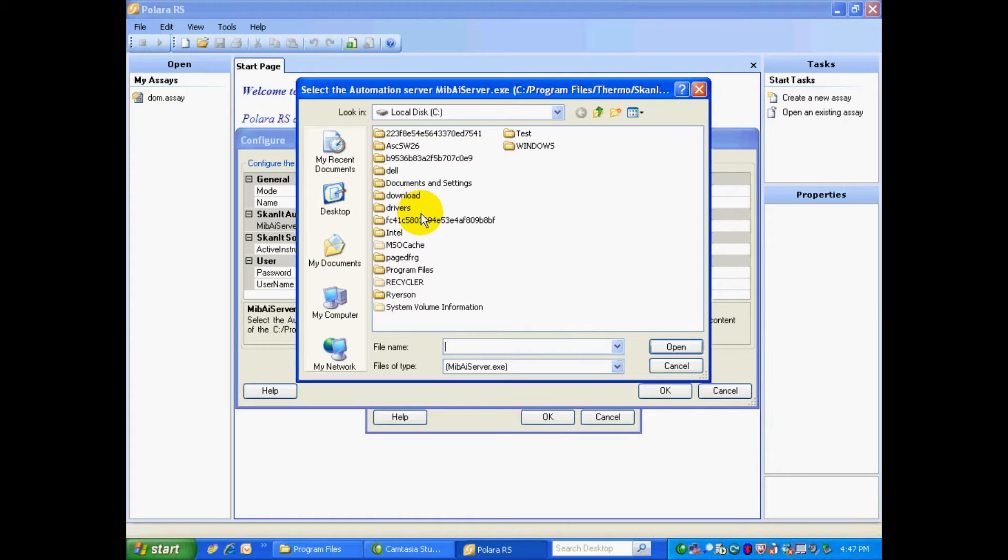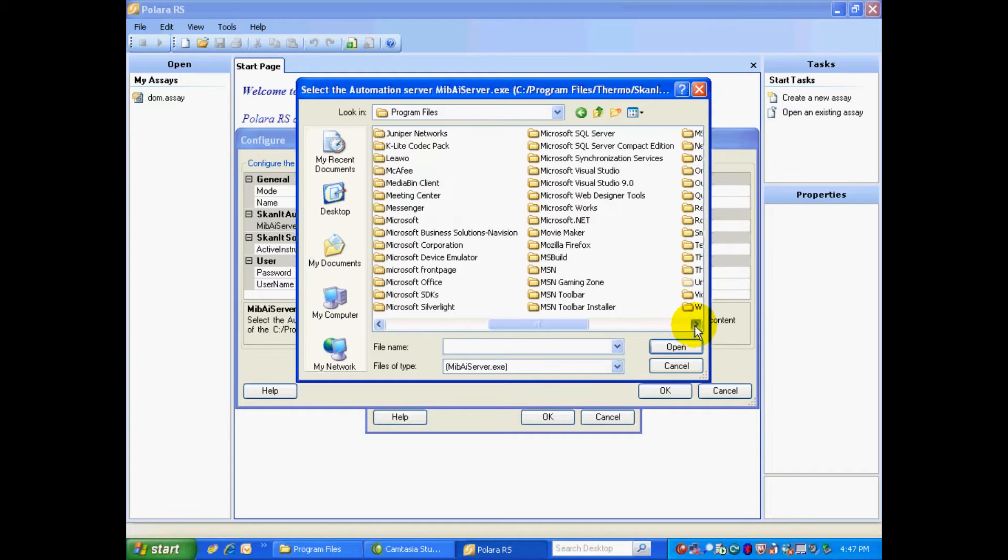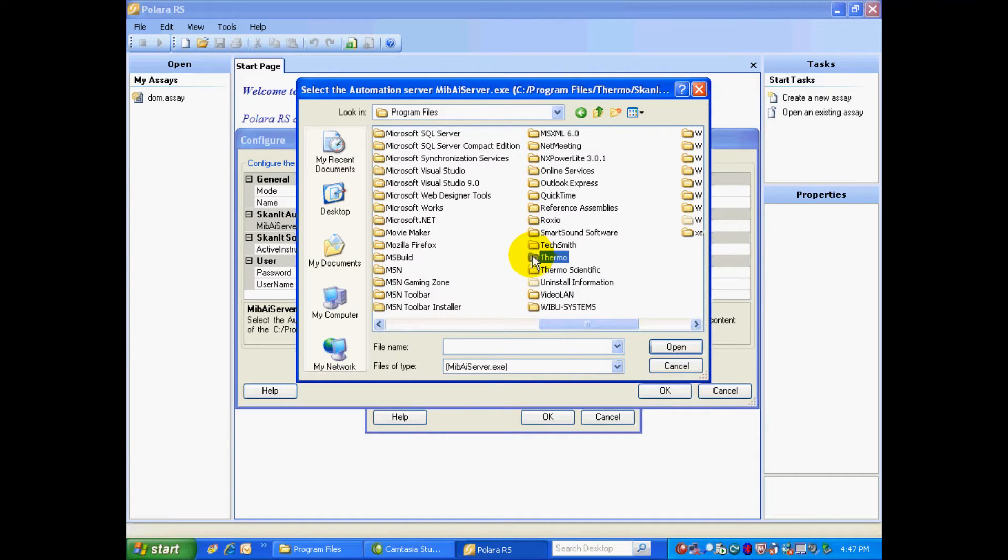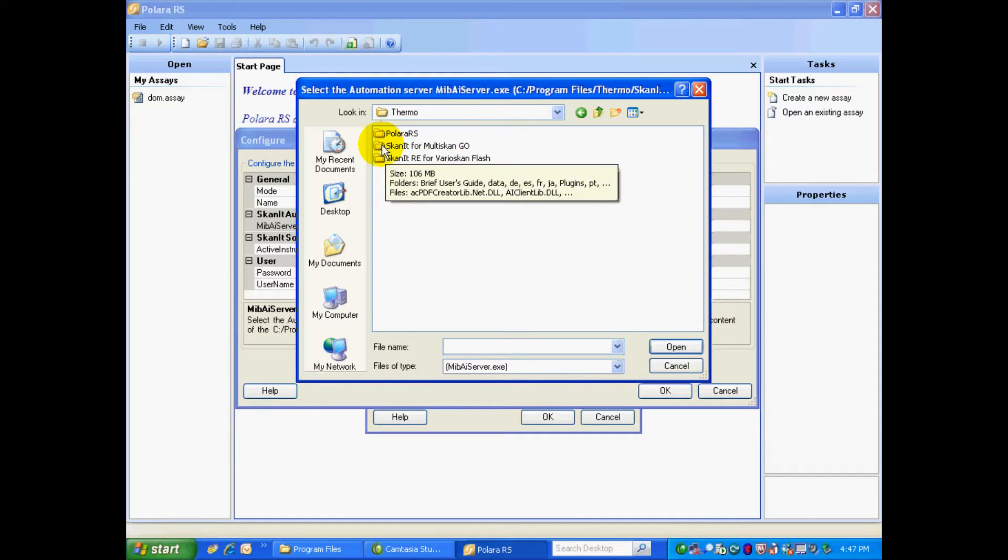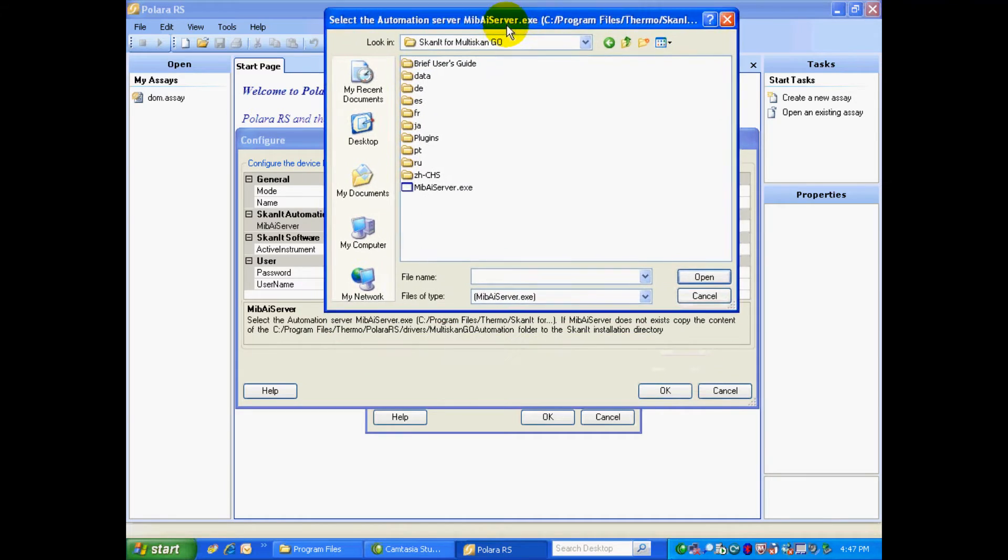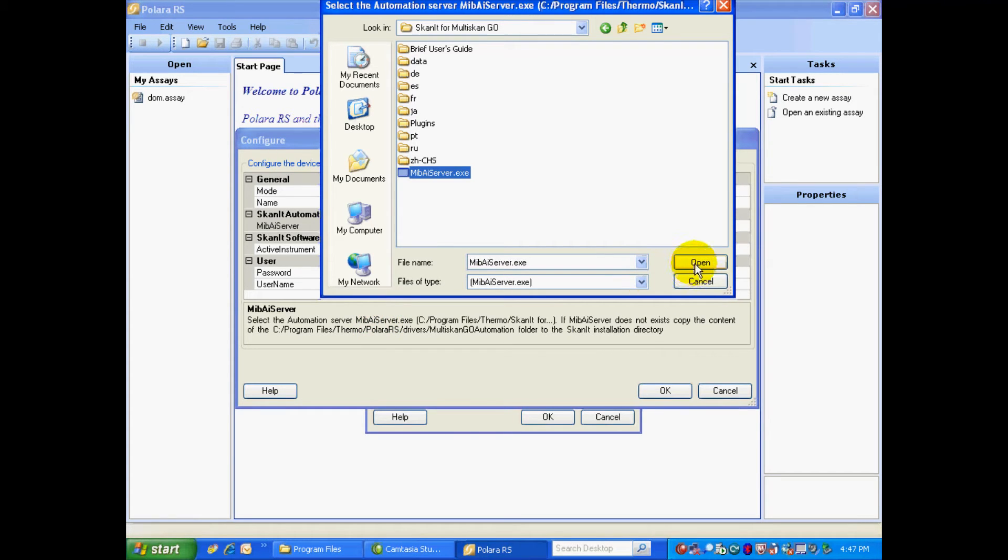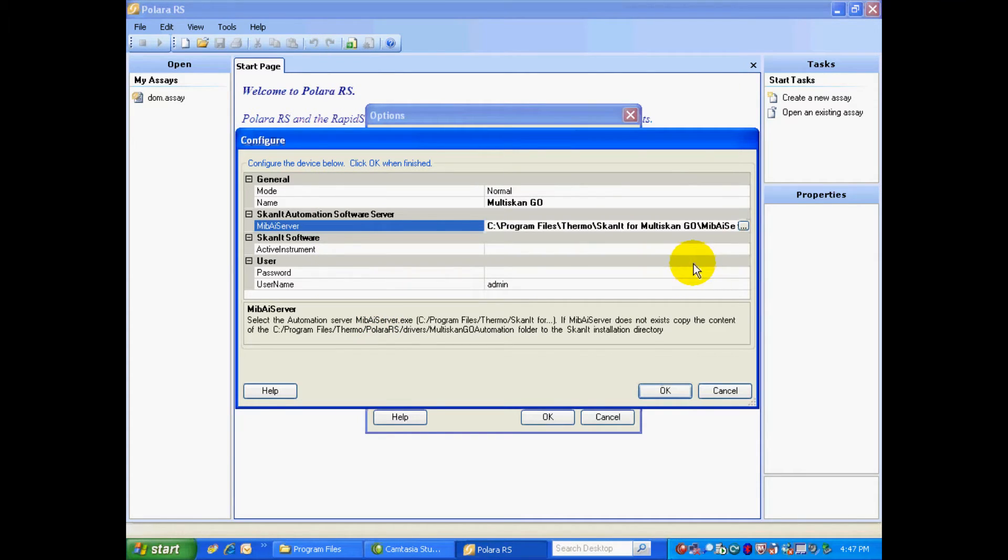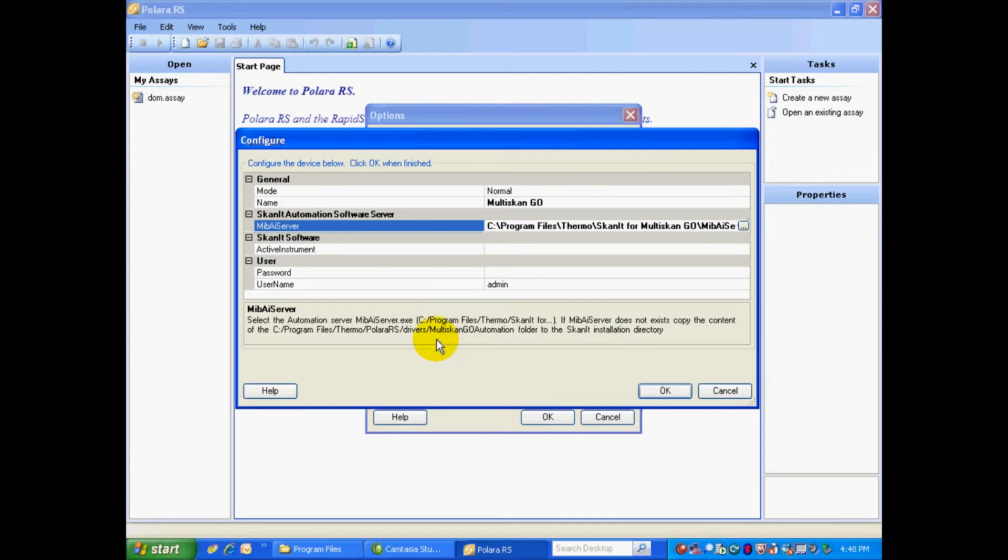You select there. We go to Program Files, Thermo, and here we have the ScanIt for the Multiscan Go. We open that, and here we go. You can see this is the file we're looking for, MIBAIServer.exe, and just click Open. Now, it also tells you if you cannot find that software there, we do include it with the driver, and I'll show you a little later in this video how to copy and paste those files into the Multiscan Go ScanIt folder.